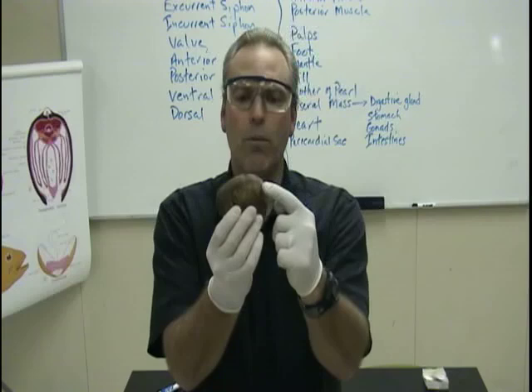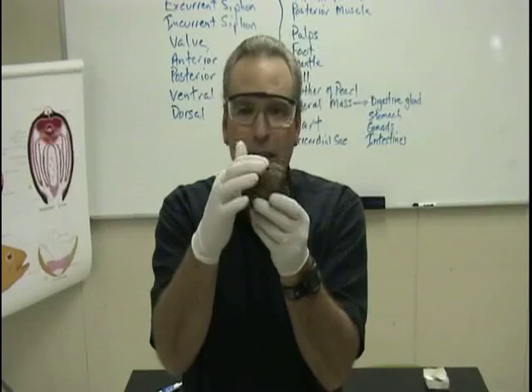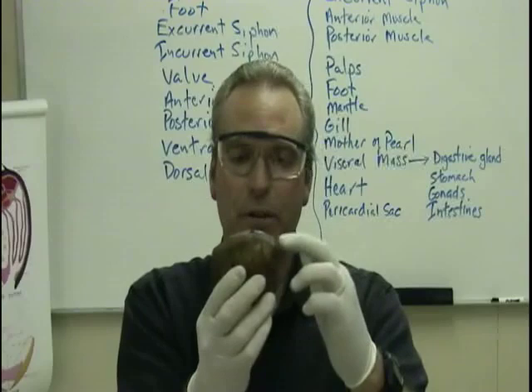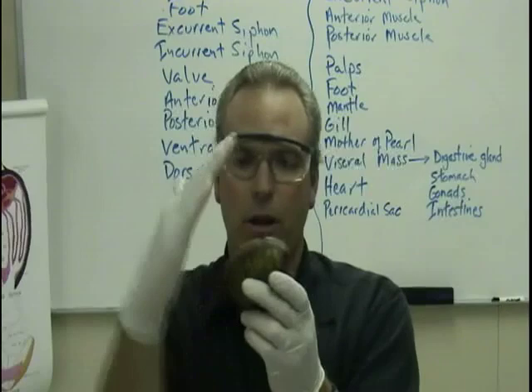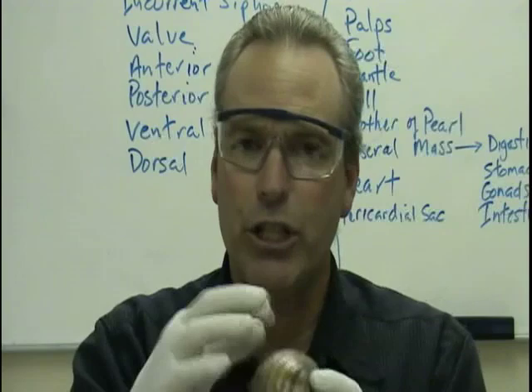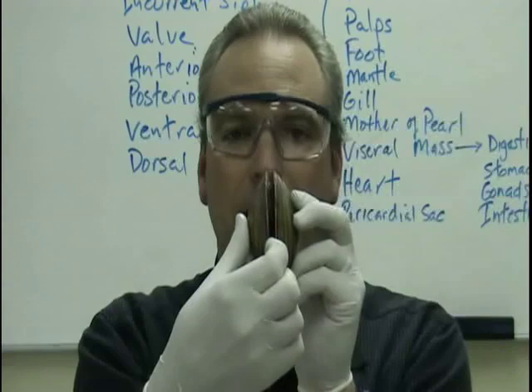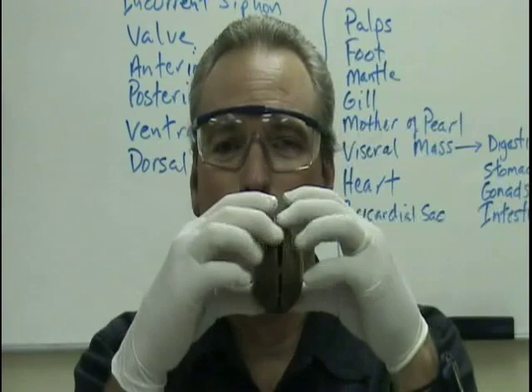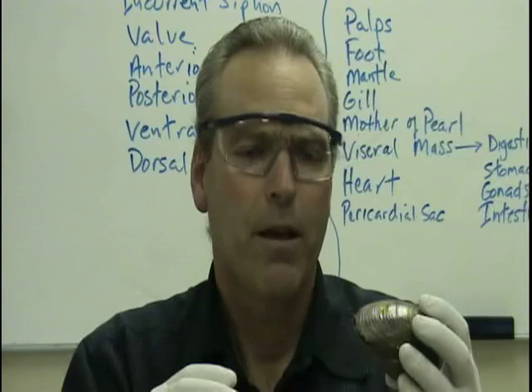The anterior side is where the umbo is — these little bumps right here are the umbo. Where they come together is called a hinge; if we were to open this up, it would hinge open. So the anterior end is closest to the umbo, and the posterior end is the opposite side. Anterior is where the umbo is, posterior is opposite to that, dorsal is the top where the hinge is, and ventral is where the opening is on the bottom. Most clams will have a little tiny piece of wood in the valves so that you can stick your scalpel inside and cut the adductor muscles. If your wood chip is not present, it's really hard to open the valve, and I'll have to get a pair of pliers to show you how to open it.